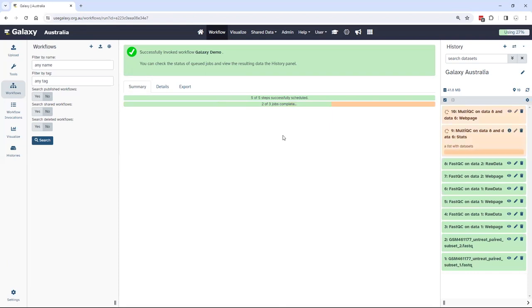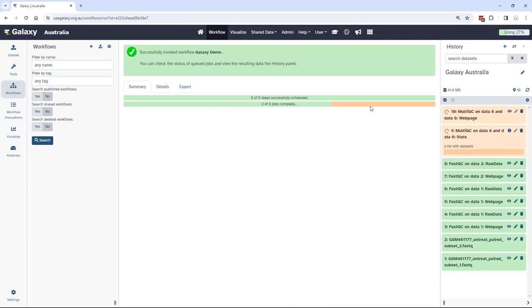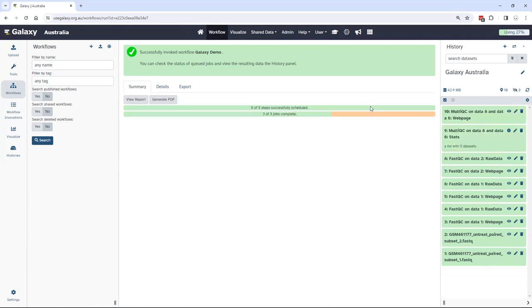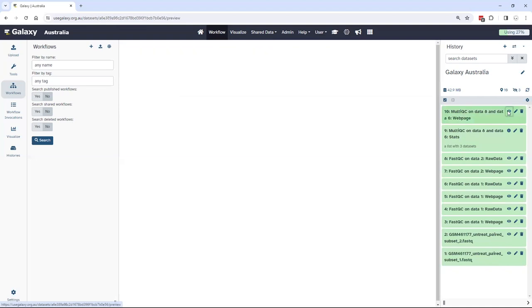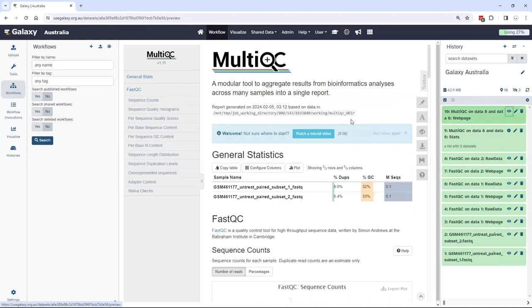Okay, so already my FastQC results have been generated and they are now being pushed to MultiQC. So you can see the FastQC results have gone green, the MultiQC has been computed, and when that finishes I'll be able to review all my results en masse as it has done just now. And here is my MultiQC result.